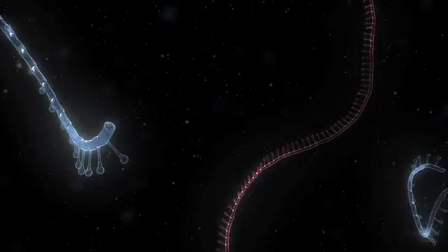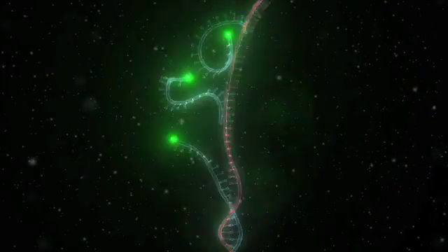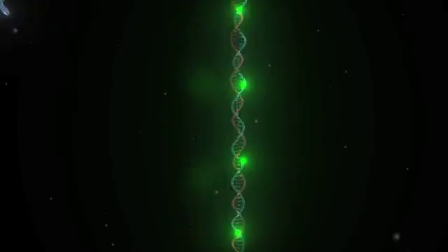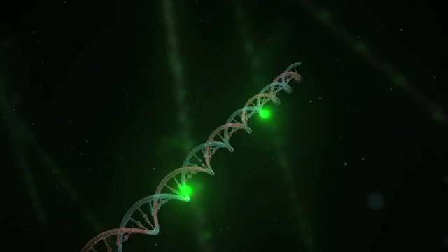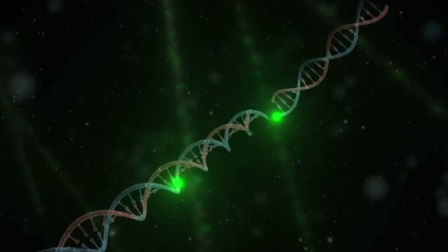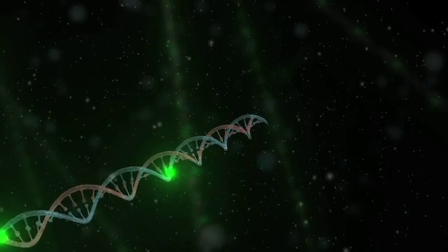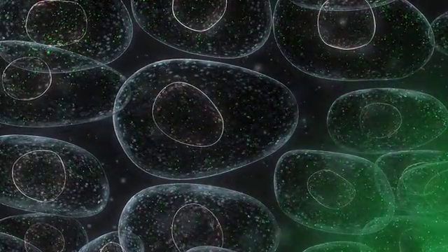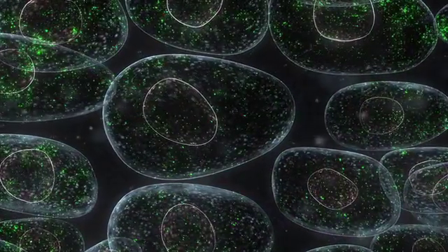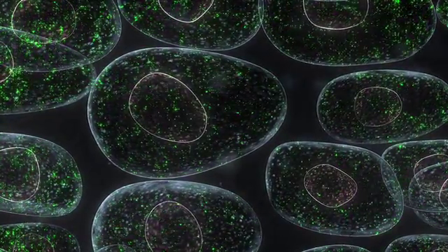After fixation, Stellaris FISH probes are added to the sample, where they collectively hybridize along the targeted RNA. The combined fluorescence of the hybridized probes can be clearly seen above background. Even in old samples with partially degraded RNA, a sufficient fraction of probes will still bind to targeted transcripts. After incubation, the wash step removes excess probes and the sample is ready for imaging. Each individual transcript is observed as a discrete spot, like a bright star in the night sky, by using standard fluorescence microscopy.